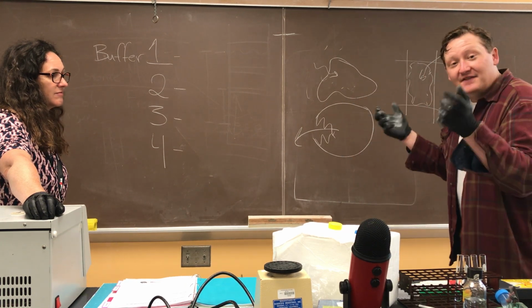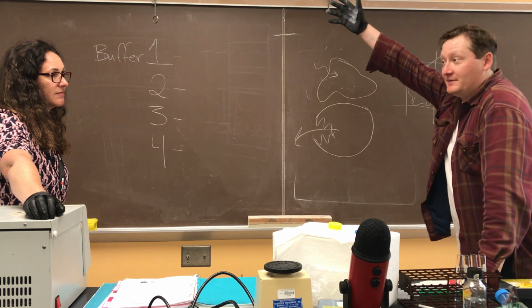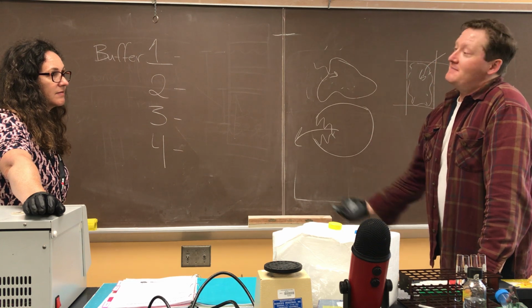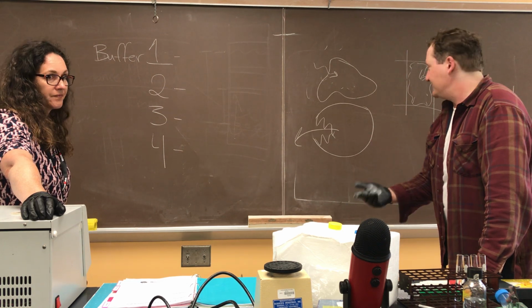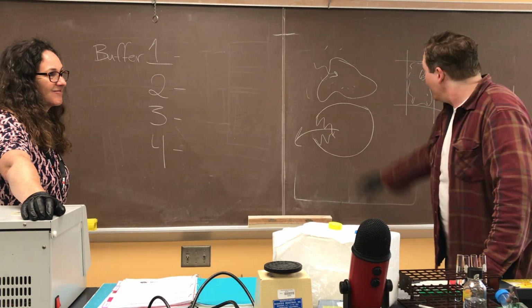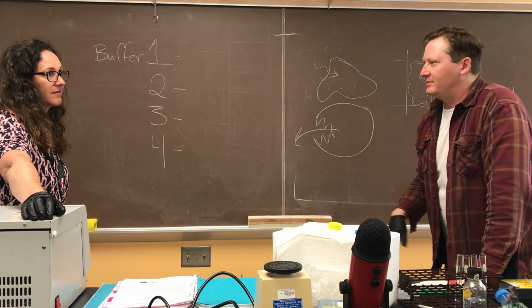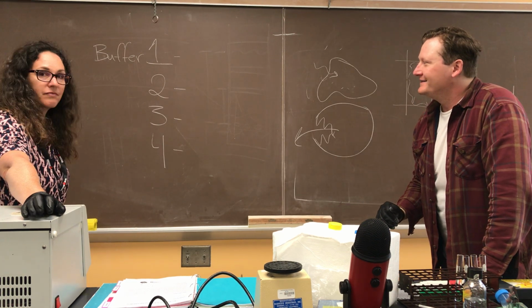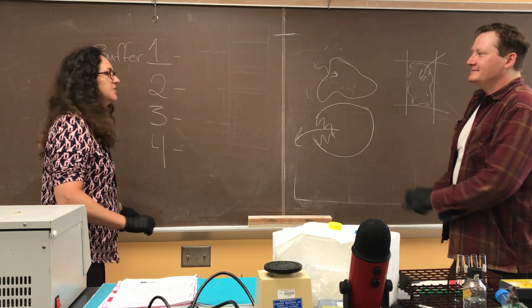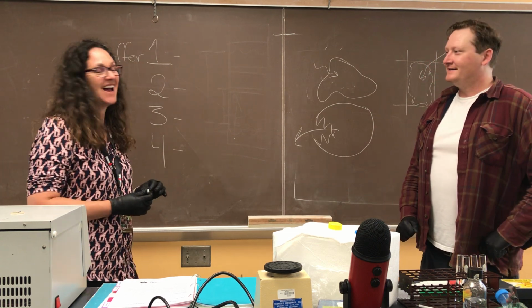We're trying to get at these proteins, see how many proteins we can extract, and we'll be using different solutions that have different tonicity values and that may or may not contain a detergent to see how well we can get all that good stuff out of some E. coli cells. We're not working with plant cells today, but there will be labs where you see plasmolysed plant cells. Okay. Great.